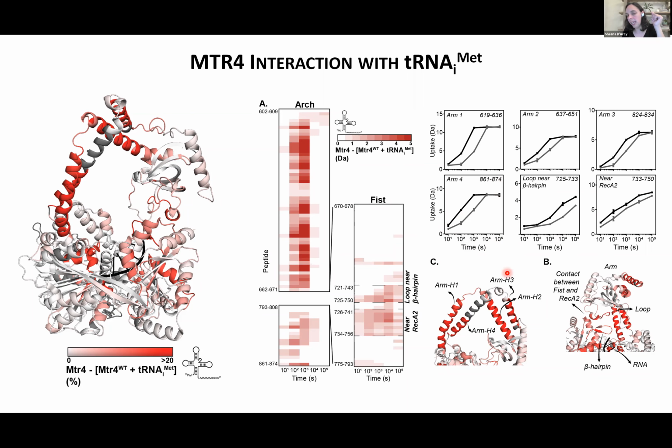I still folded and happy out here, but there are some HDX experiments which are really sampling a lot of time points in this early time period. And it's those studies which have made this conclusion that binding happens first and conformational change happens second. But in this time scale that I'm using, we cannot say that, because basically the secondary and tertiary structure of the protein are going to dominate more in the actual amount of deuterium that's incorporated. That was a very convoluted answer, but hopefully it answered your question.